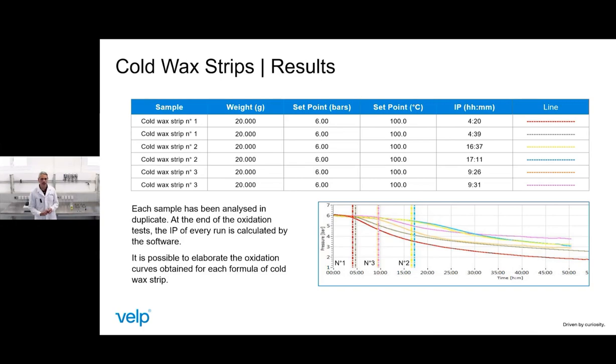Each formulation has been tested in duplicate to verify the repeatability of the sample. As you can see in the graph above, each formulation has different oxidation profiles and shows different bending curves with different induction periods.